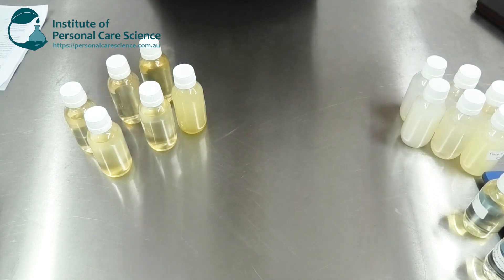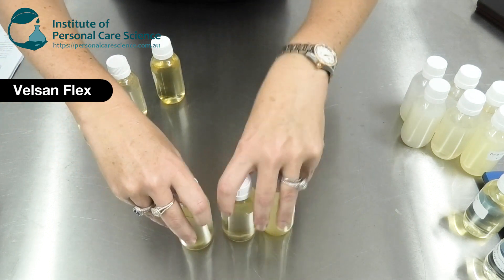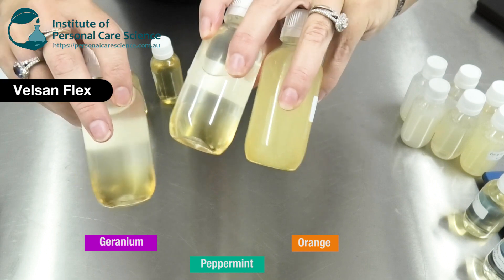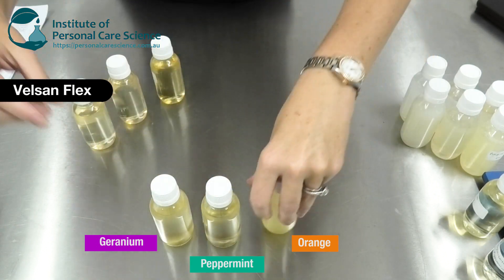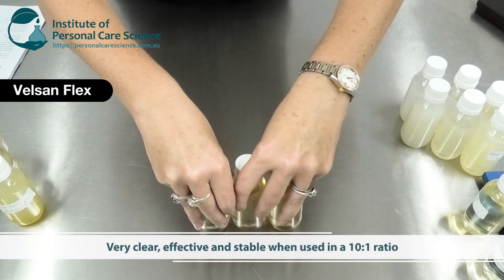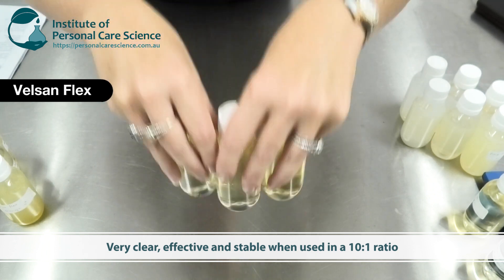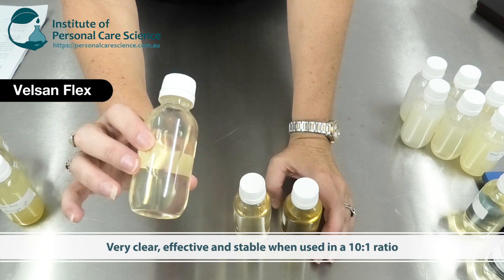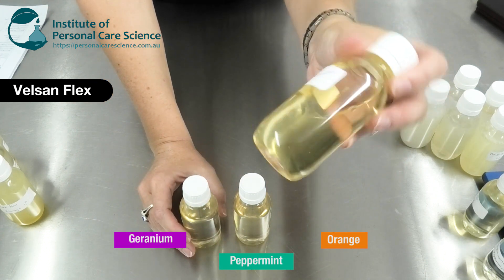The other material I looked at was Vilsanne Flex. Again I started with a 5-to-1 ratio and you can see there is some residue at the bottom — it did not solubilize totally. But when I altered that ratio to a 10-to-1 I got beautiful clear solutions. So if you want really clear end results, the Vilsanne Flex performed exceptionally well at a 10-to-1 ratio.